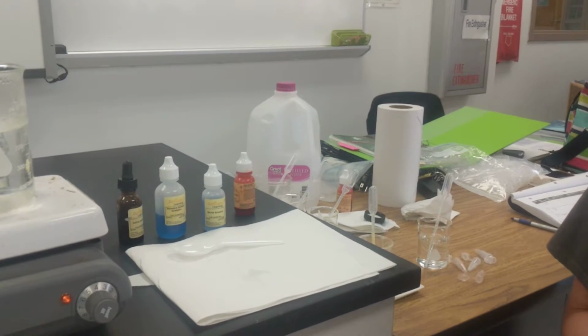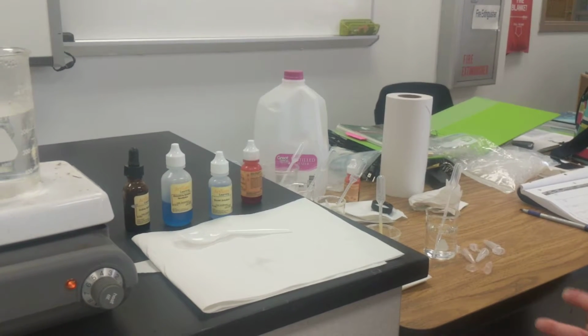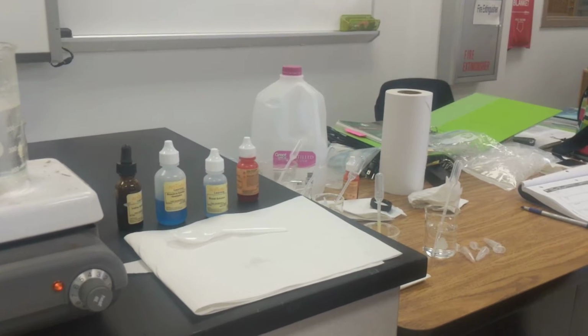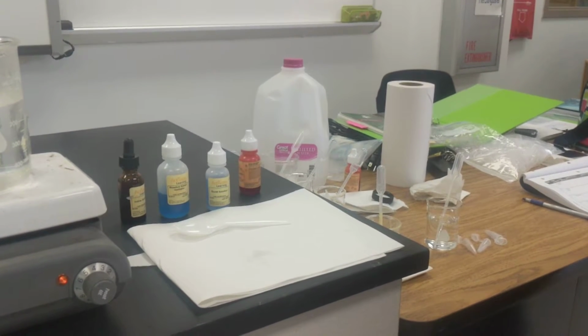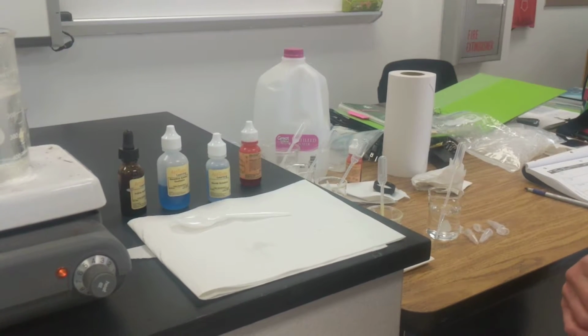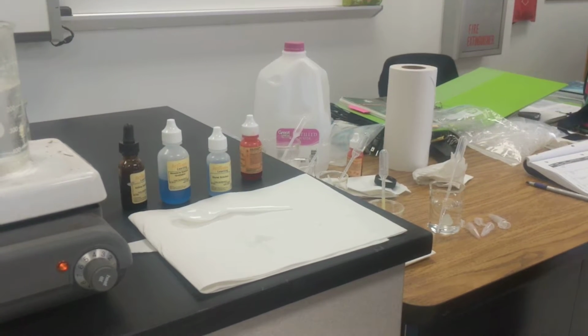Okay, and here we go. The last item that we're going to be testing is water. And so I'd like you to work on your predictions. Does it have starch? Does it have sugar? Does it have protein? Does it have fat in it while I fill these vials? So go ahead, take care of your predictions. I'll get these filled.